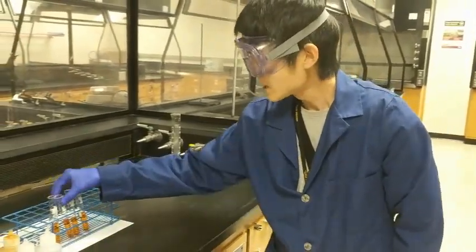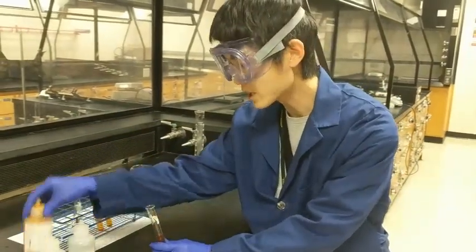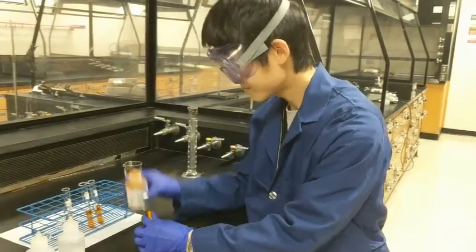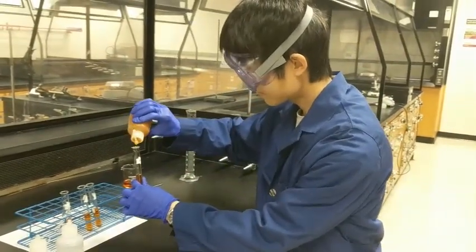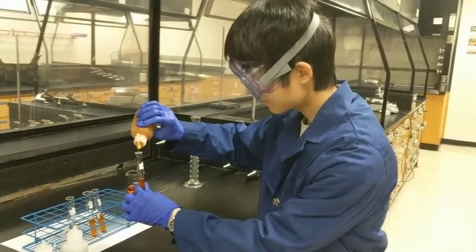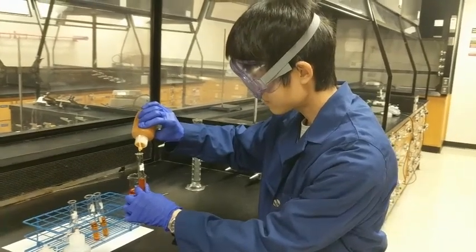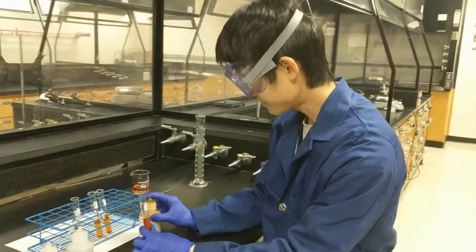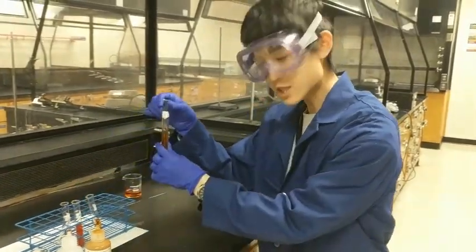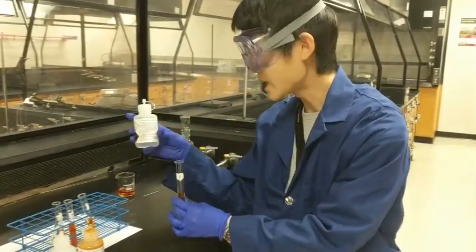For the second test tube, we are going to add another 20 drops of iron(III) chloride solution. For the third test tube, we're going to add another 20 drops of ammonium thiocyanate solution.